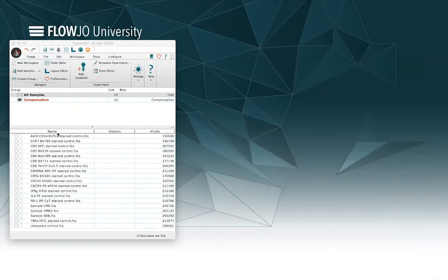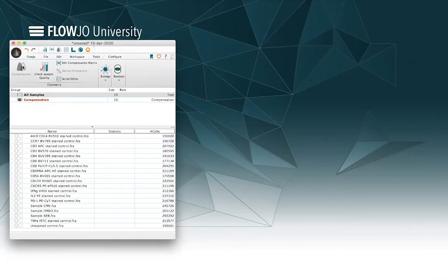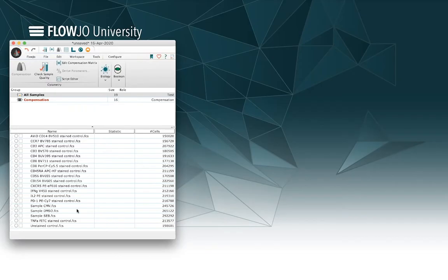Now one of the things that a lot of users will note immediately when you first load samples into the workspace, the compensation icon here at the top of the workspace, or if we look into the tools window, is grayed out. So compensation is not available yet, and you might ask why not? We've got compensation controls in the workspace. Well, there are two different criteria that are required before this button will become activated. Number one, you've got to have more than one compensation control loaded into your compensation group. Okay, check that box.